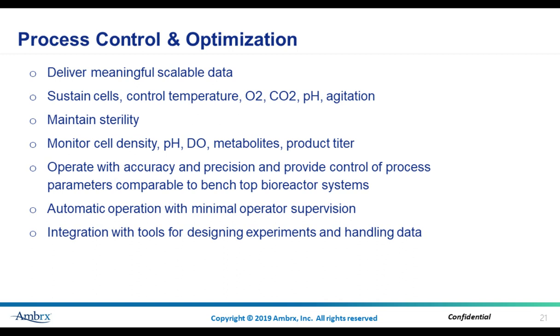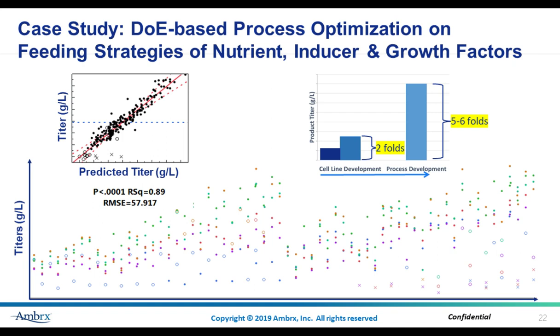Variations in the macro environment parameters from optimal levels can have a dramatic impact on the culture performance, productivity, and the product quality. Appropriate online and offline sensors can provide a lot of information that can enhance the process control. I was supposed to share a temperature shift modeling case study, but it was rejected by the legal department. So I will share a feeding strategy optimization case study.